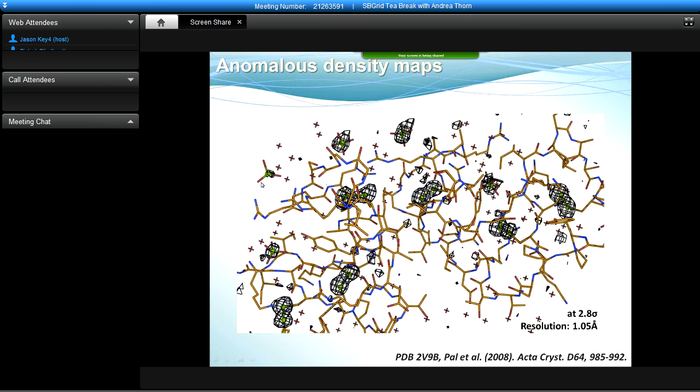However, there's one sulfate here, and actually I would argue with that being fully occupied. It seems like the sulfate is only very partly occupied, and Anode can be used to give you such an indication, or to give you an indication of what reactions happened with radiation damage, or if you are looking at MAD data at the identity of metal ions.